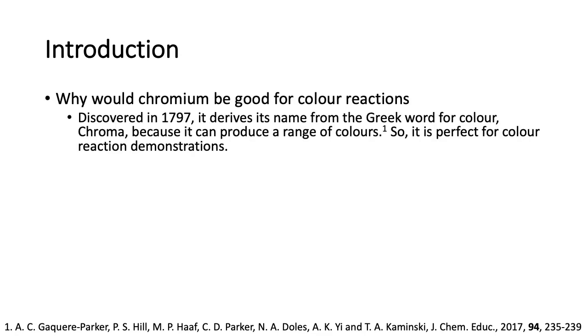So, why would chromium be good for color reactions? It was first discovered in 1797, and it derives its name from the Greek word for color, which is chroma. That's because its compounds produce a wide range of colors. So that's great for these kind of color reaction demonstrations.